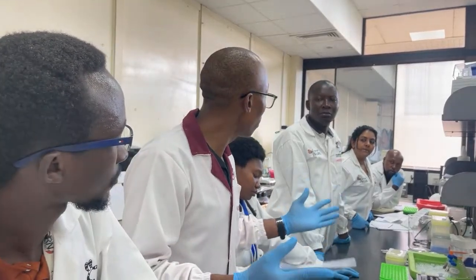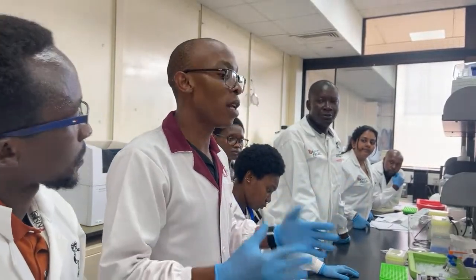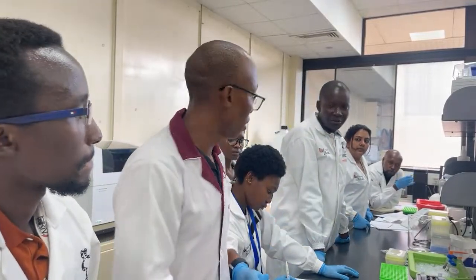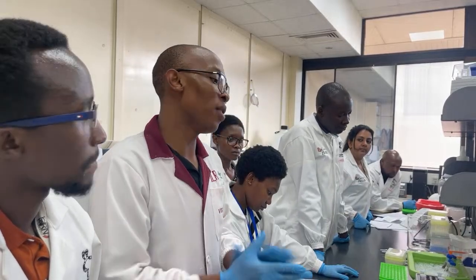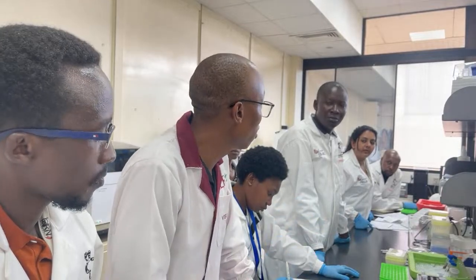You can do that, and then come to us with, okay, the estimated genome is this. And if you have a related family somewhere in the family, you can use that to determine the size of that organism. But if we have zero information, we just say, okay, let's just go with one SMRT cell and see when we do the assembly how much we can come to.